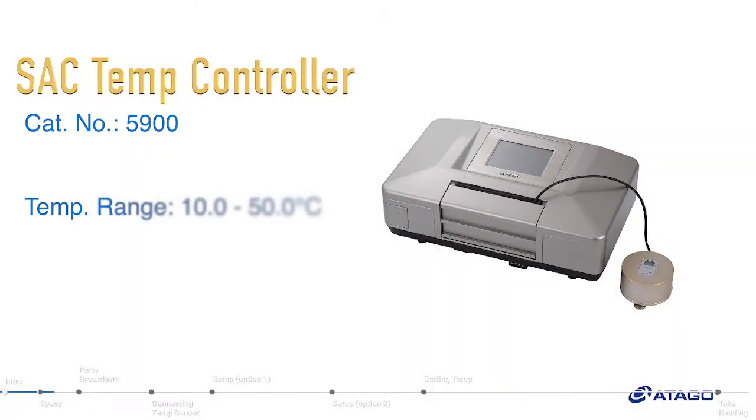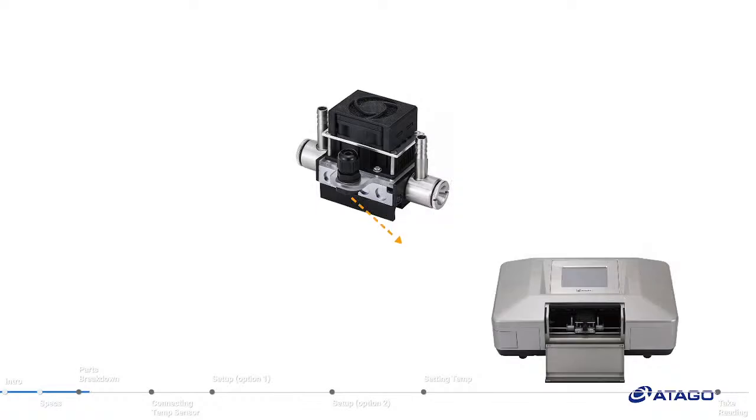Okay, so temperature controller, catalog number 5900. Temperature ranges from 10 to 50. So normally you're either reading 20, 25, or 30, depending on the substance you're testing. The range of the temperature controller itself is 10 to 50 with an accuracy of 0.2. It's a thermal module.